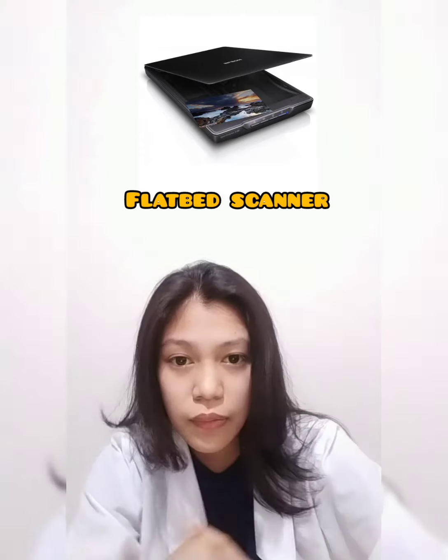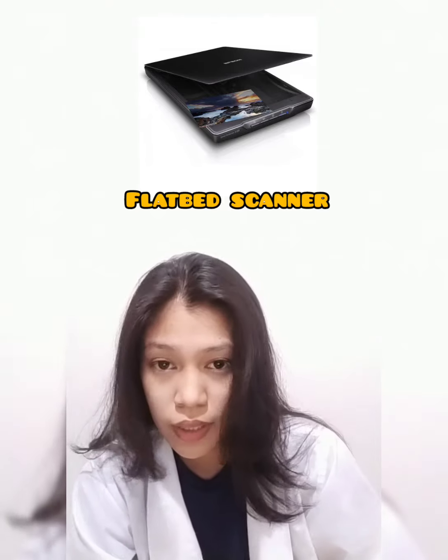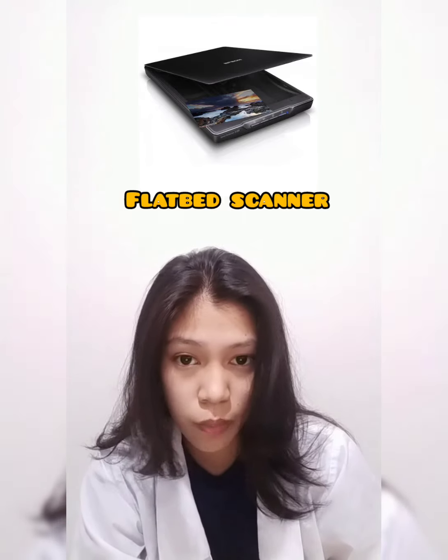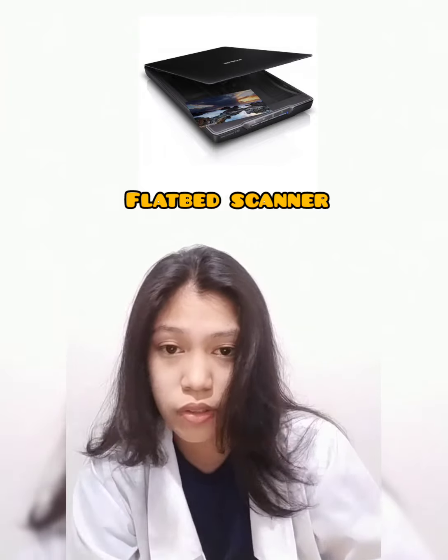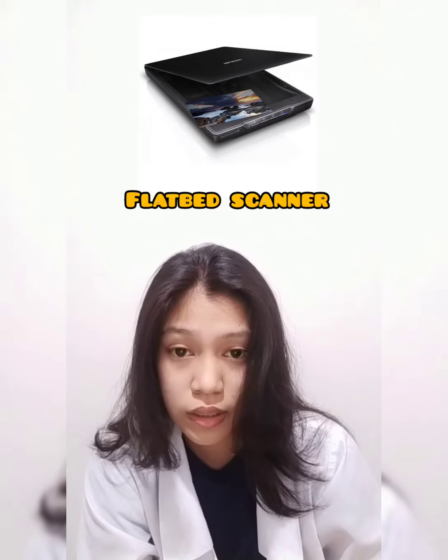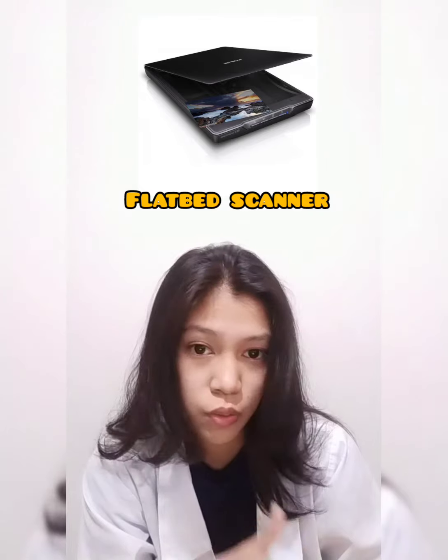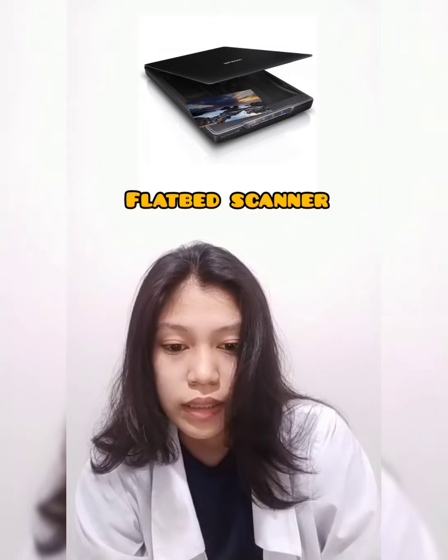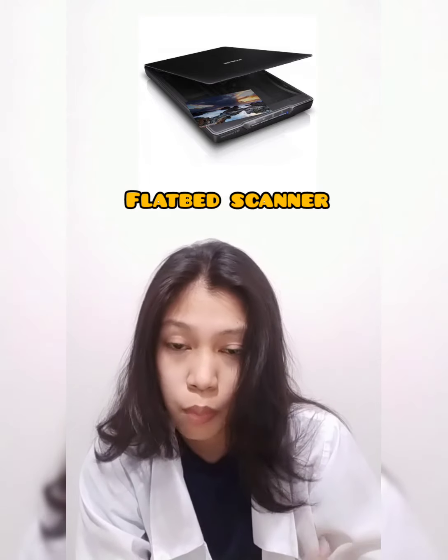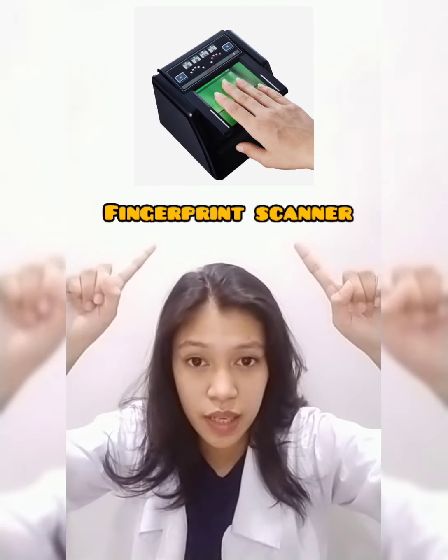The next instrument is a flatbed scanner. A flatbed is a type of scanner or copier that uses a flat glass surface for scanning documents or other objects. It can also scan single pages or bound bundles of documents, as well as non-paper objects like ID cards, and it can often scan in very high resolution. Most flatbed scanners have an adjustable lid that can be raised to allow magazines, books, and other thick objects to be scanned.